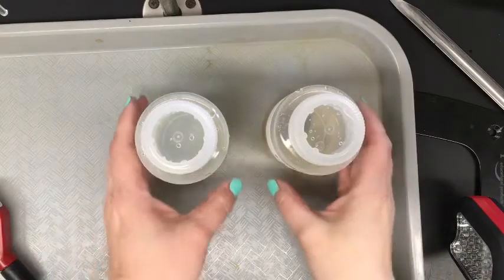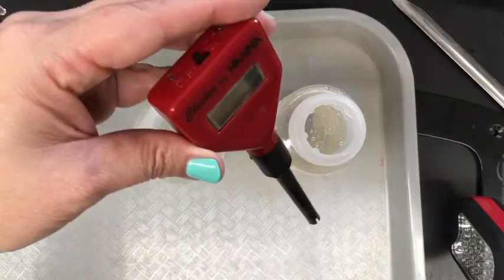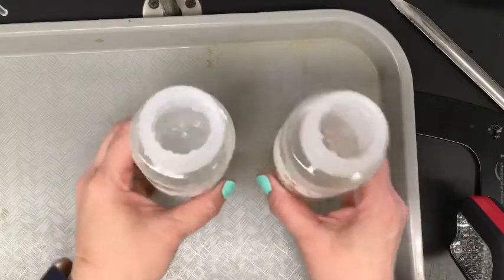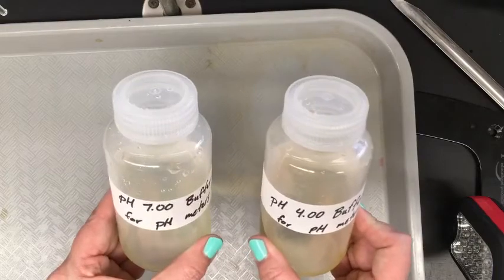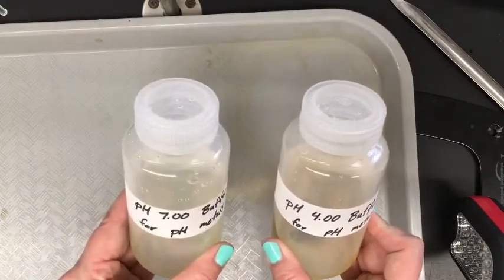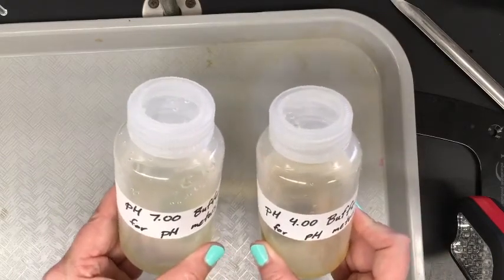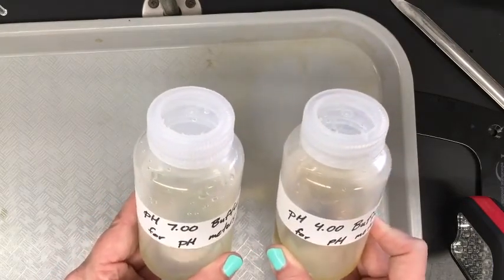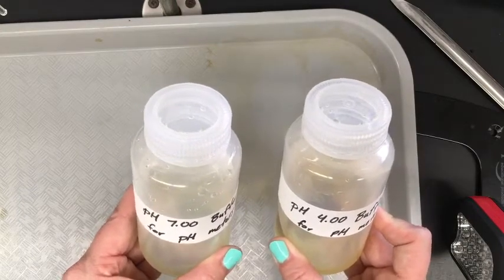In this experiment, we're going to use a pH meter, one of these devices, to measure the pH changes over the course of a titration, and from that we can make a titration curve. So the first thing you have to do is calibrate your pH meter. We use a pH 7 buffer and a pH 4 buffer, and then we dip the pH meter into those two solutions. We know that these are the pHs, we're certain of that, and then we can calibrate the meter. So that's the first step that we would do.